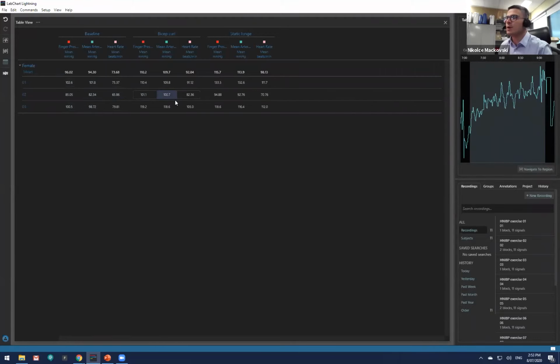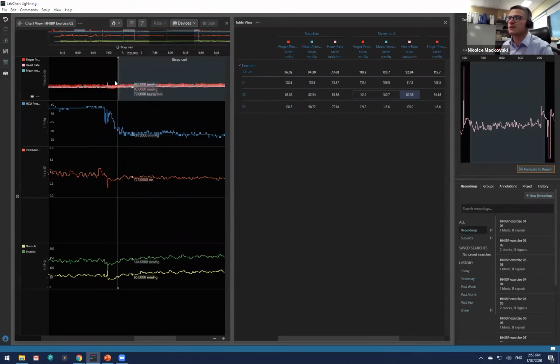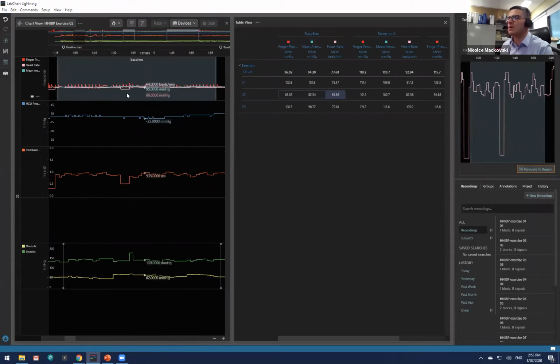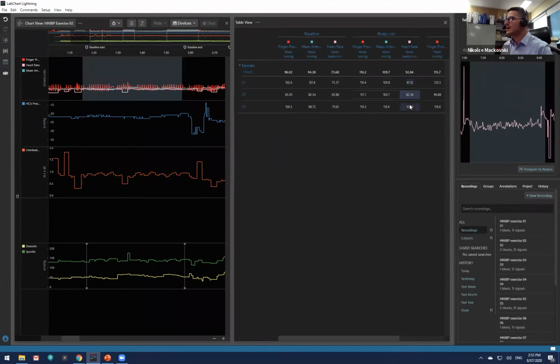Notice something that's really important is that when this table does get quite large, but you want to know exactly where that region is, something that's really nice to have in Lightning is the ability to navigate to that region. So anywhere here that I click, if I want to know something more about that, whereabouts in that chart is it, I can actually click on here to go navigate to that region, and it'll instantly navigate to that region for me. So that's a really handy tool to have, just to be able to navigate to wherever I want to go. So that's how it works.